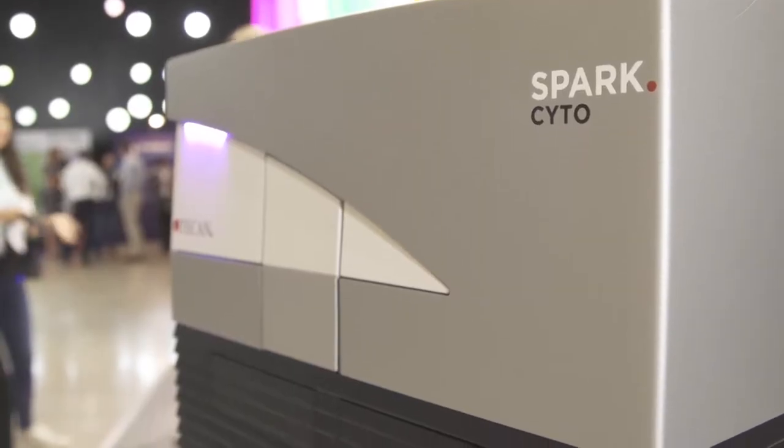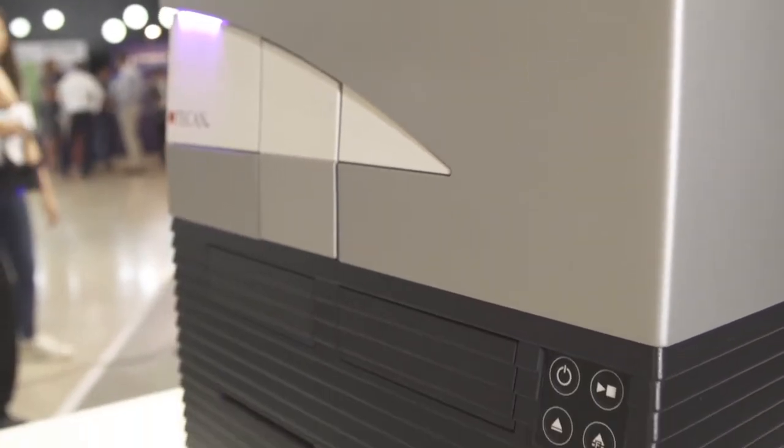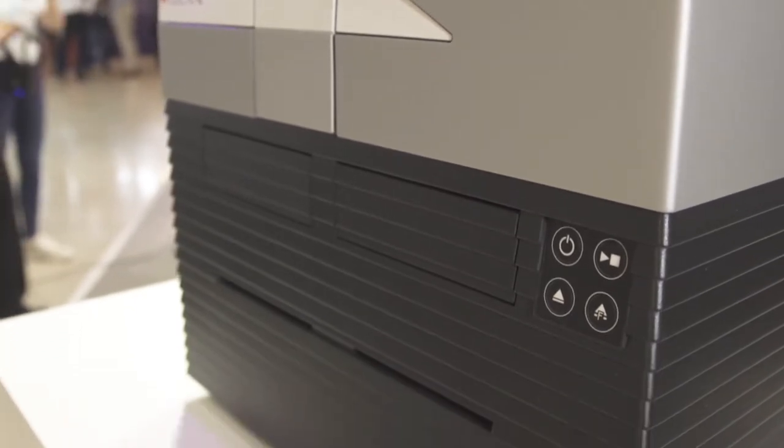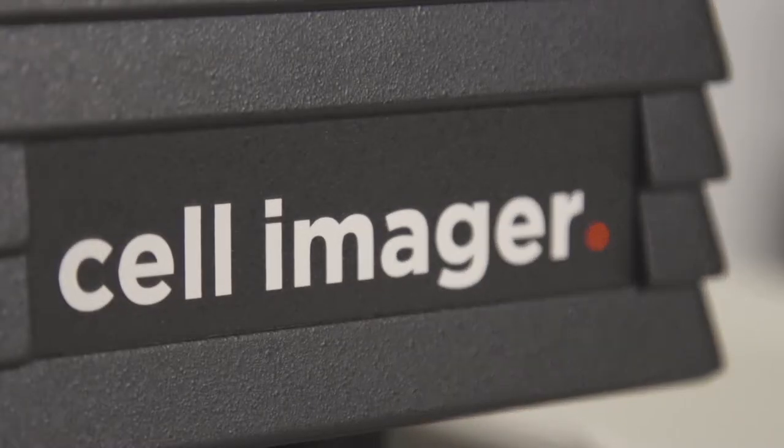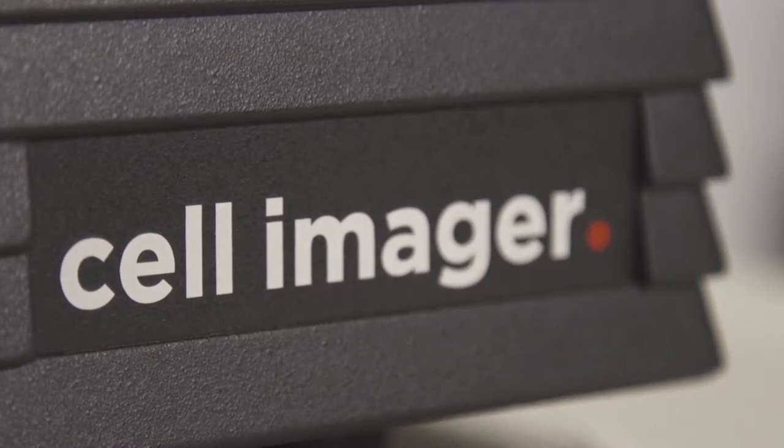The Spark CYTO was the first live cell imaging multi-mode reader with real-time analysis. It has three objectives 2x, 4x and 10x and four fluorescent channels as well as bright field and digital phase contrast.